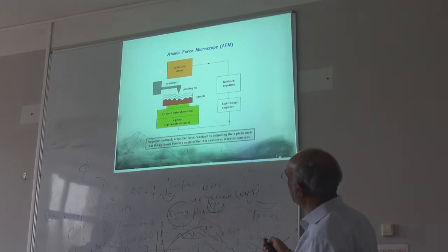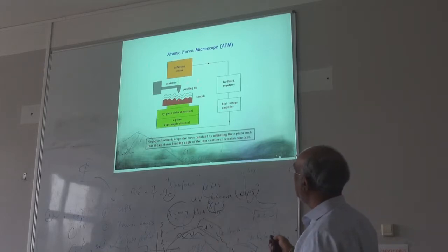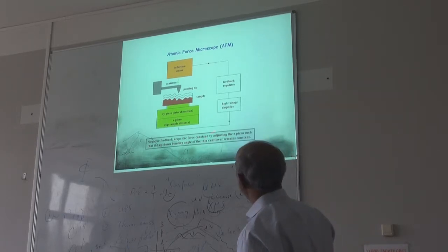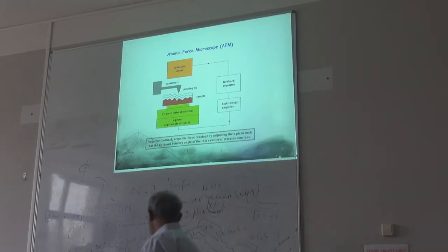To do that, you have to reflect some laser light here. From that reflectance you can have some detector. So the important thing is you need to keep the force constant. In the STM, you have to keep the current constant.